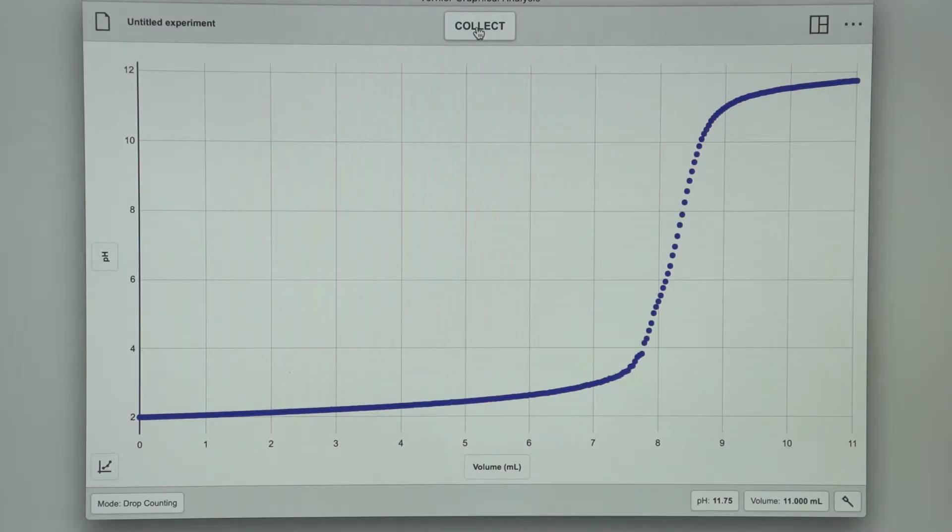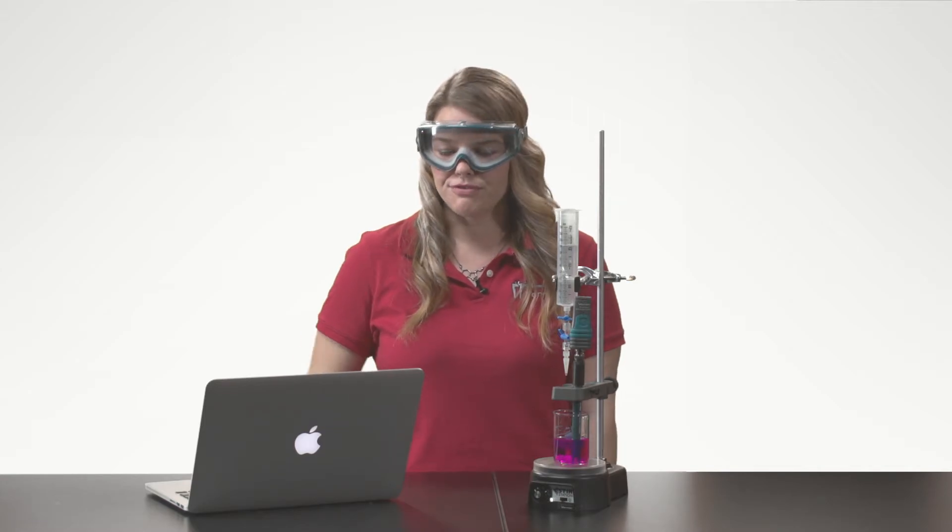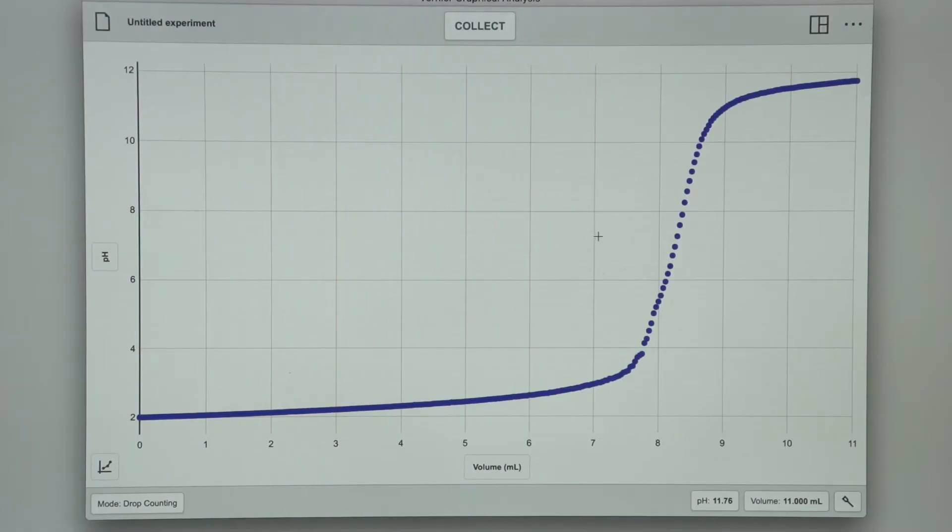Now I have a little bit of work to do to determine the equivalence point. I have a few different options for determining this. First, I can tap along the graph and find the volume where the pH changes most dramatically.